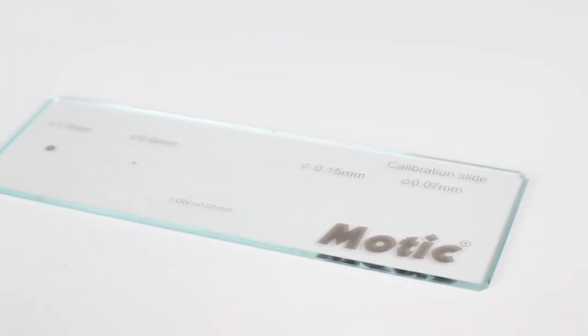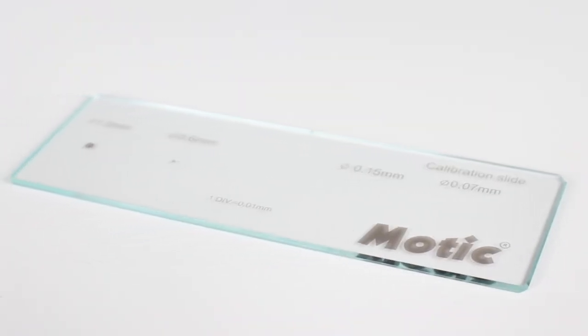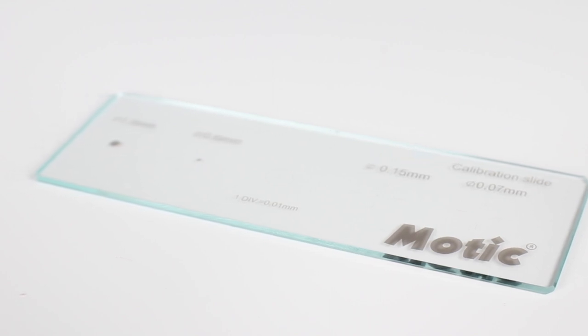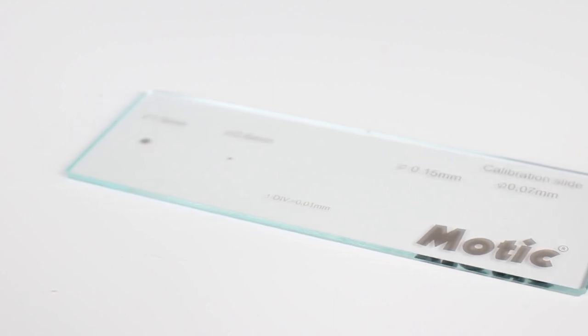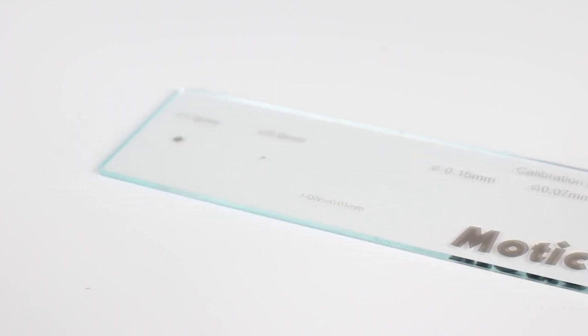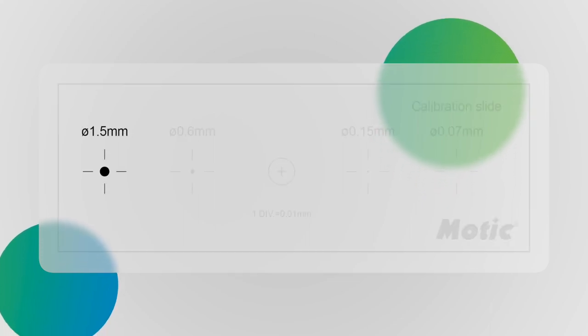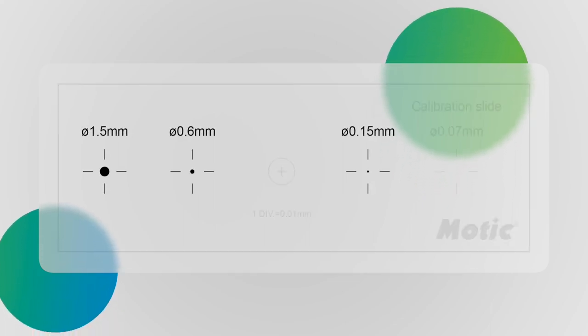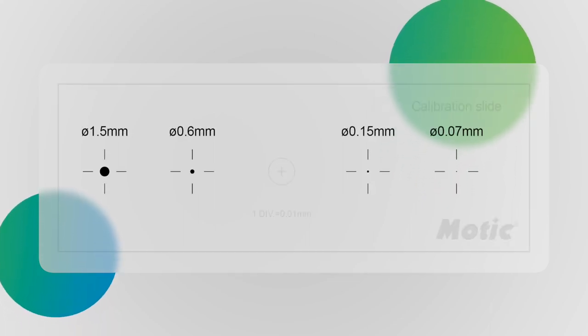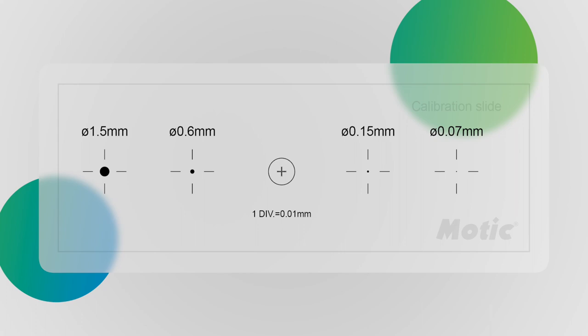To do the calibration process, our calibration slide supplied with all of our digital products is perfectly suitable. On the glass slide, you will find 4 dots of different diameters and a cross-scale of 1 mm in 100 editions.